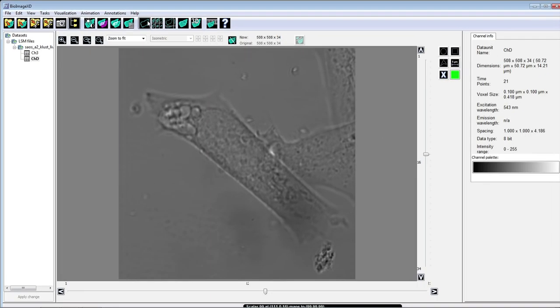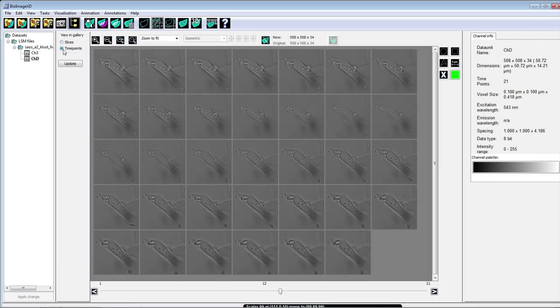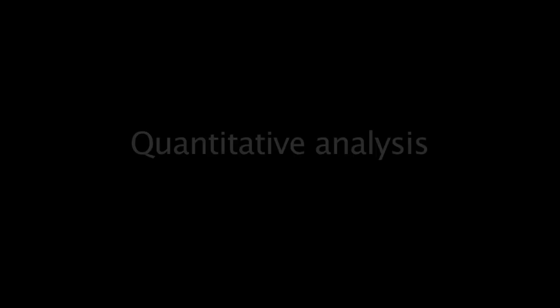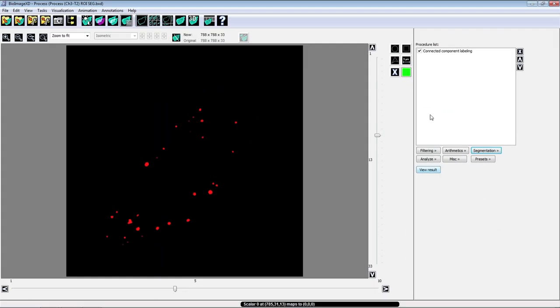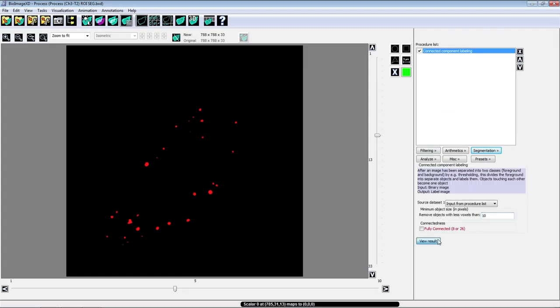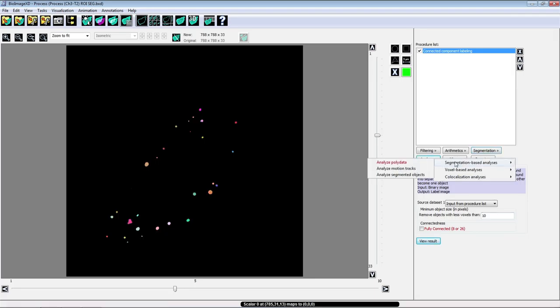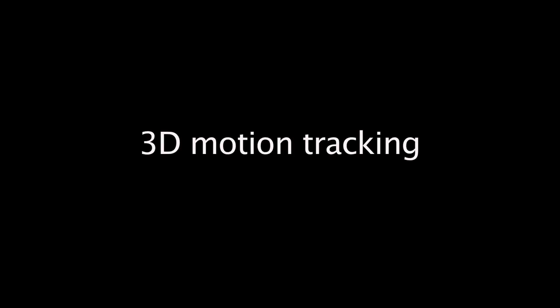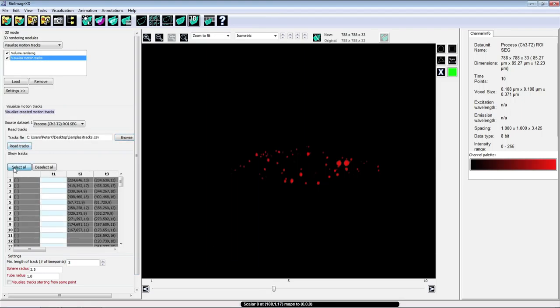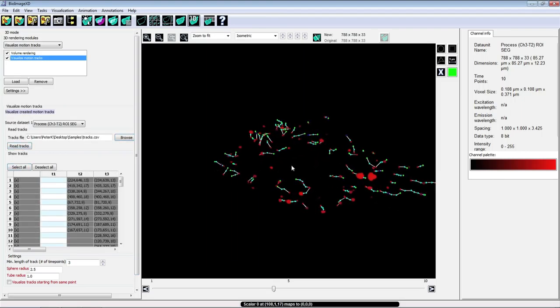BioImage XD offers all the basic processing features with multiple visualization modes. Analysis tools include, for example, advanced internalization and motion tracking algorithms. All the features are compatible with high-throughput processing.